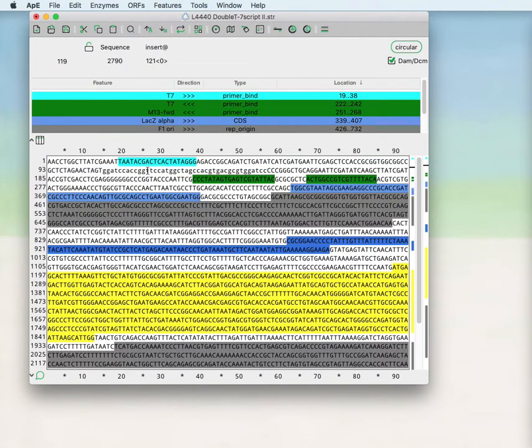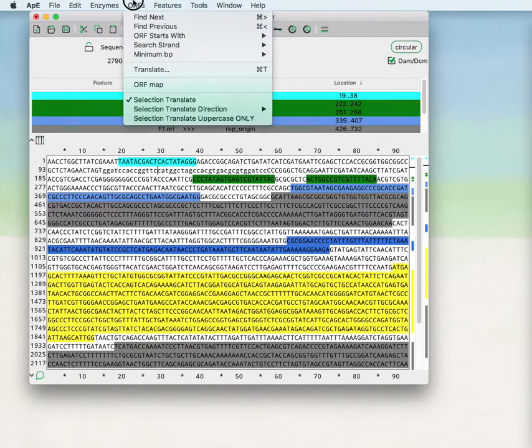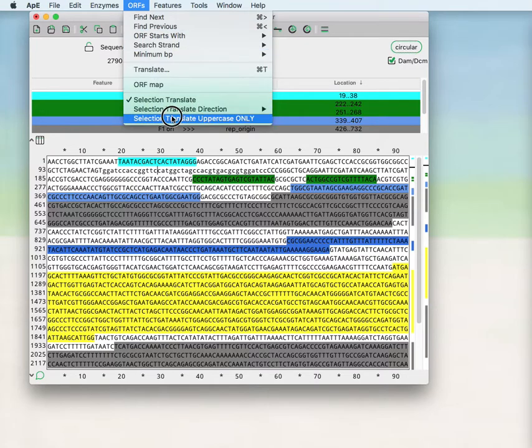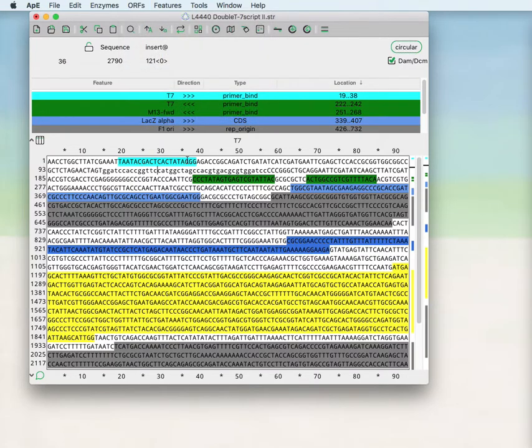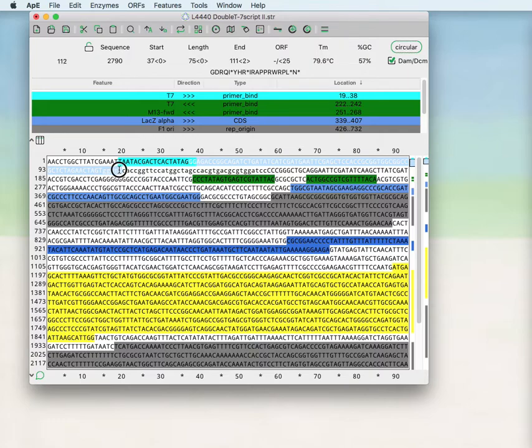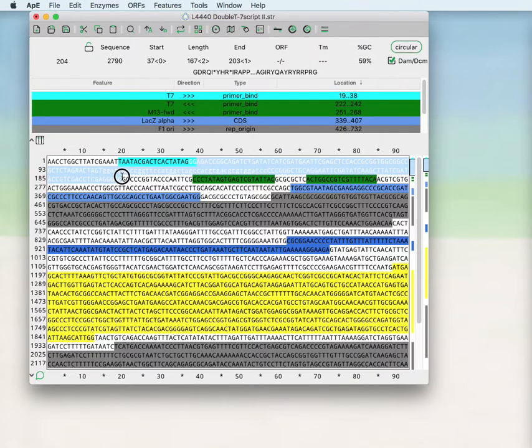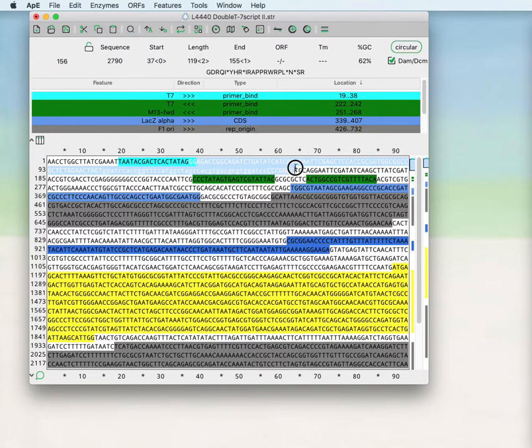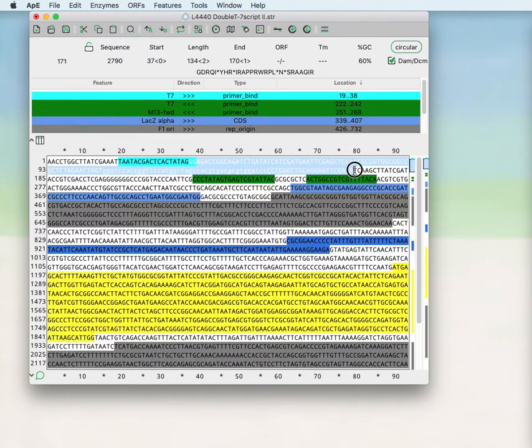For example, here you can see the translation is not changed when you move through this lowercase region, but then does change when new uppercase text is encountered.